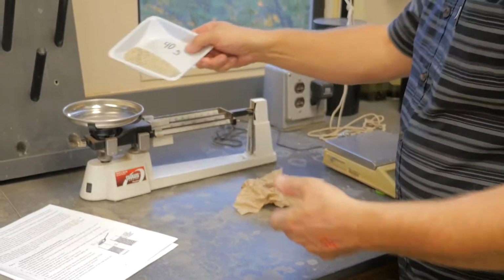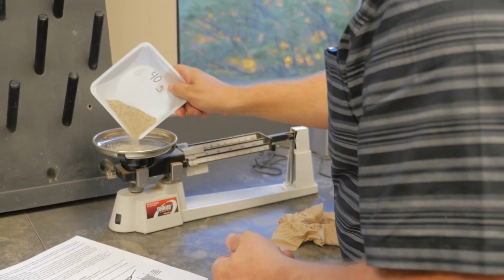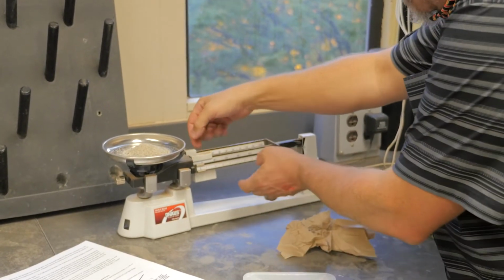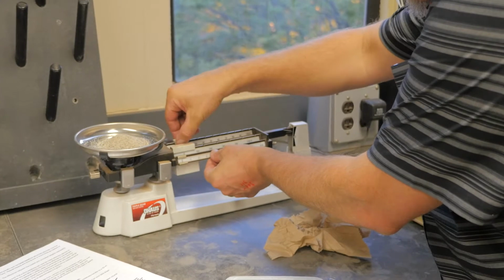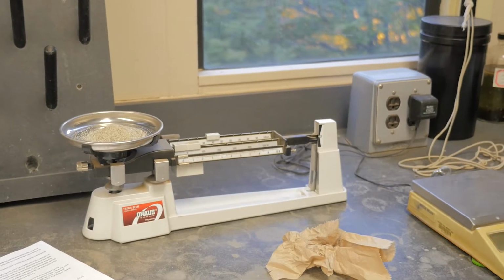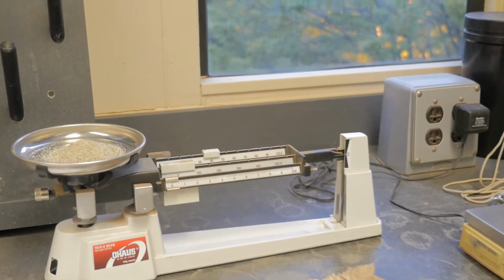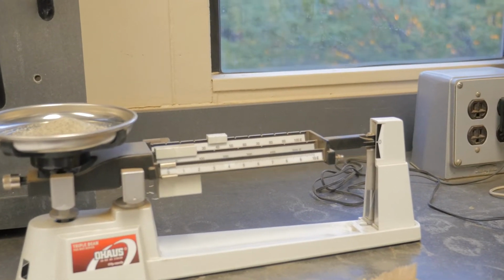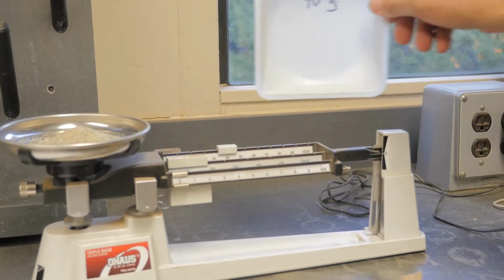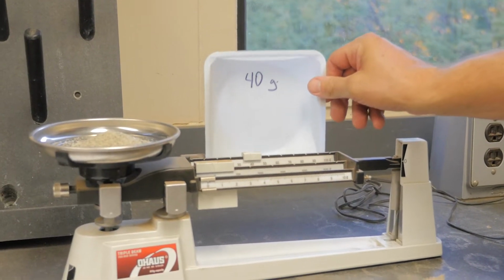You hear about a balance or a scale. This was the way that it worked: you used something that was in balance with something else, a known weight, and you could compare things based on mass. Here we did a cross comparison of the weight from the electronic scale and the mass on the triple beam, and it was great. It comes right up to 0 and balances out perfectly, or is good at the level that we need to work at.